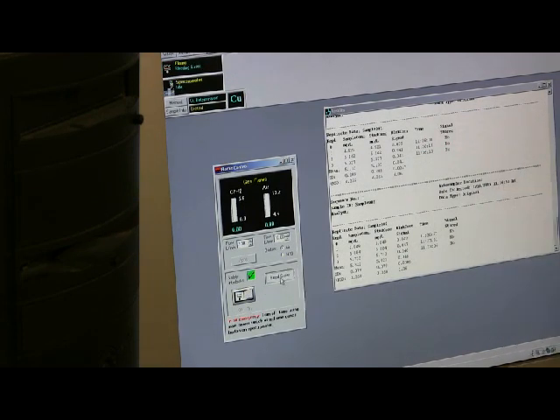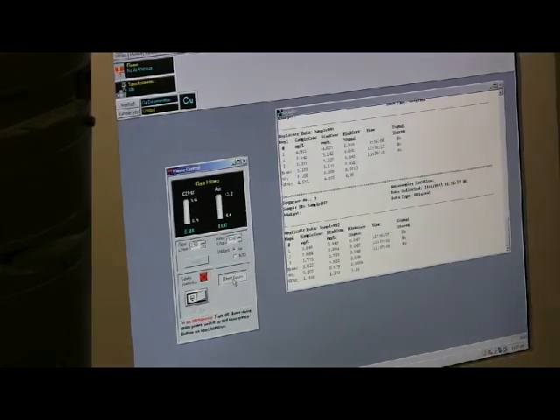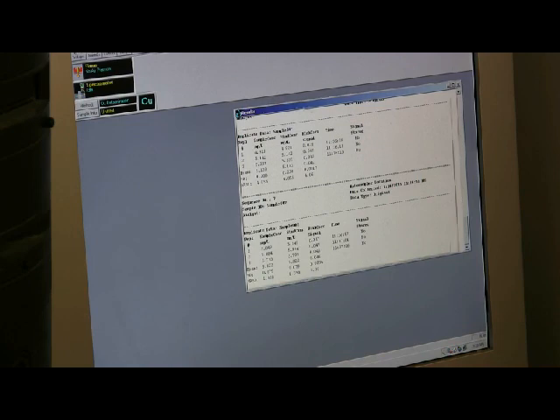So whatever is left, it just goes down there. So it's a good idea to always bleed gases after you're done with the experiment. And don't close this window because now you're done with the experiment and I still have to figure out how to reopen the closed results. So try not closing it.